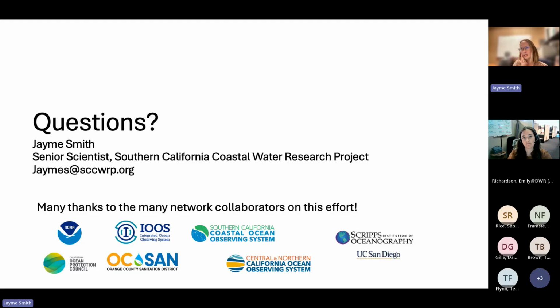So some people have done it, and then there's fine tuning that you would want to do. They'll change out the pumps, like, these are my Lugol pumps, and these are my non-Lugol pumps. If any of you have run a flow cytometer, it's got the same thing: it likes things a certain way.